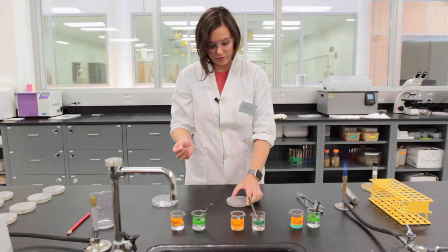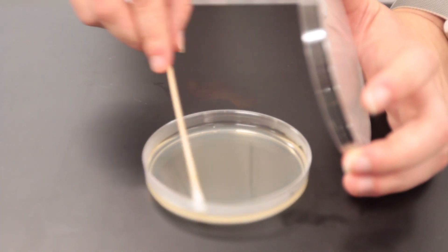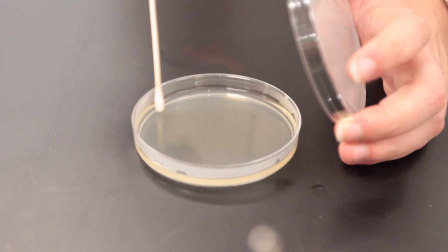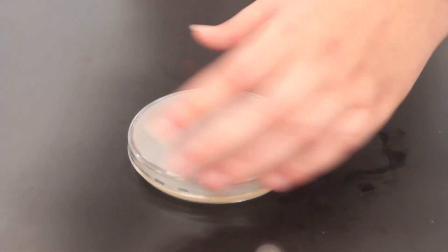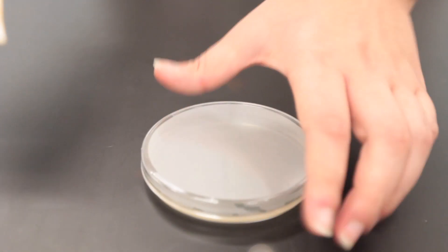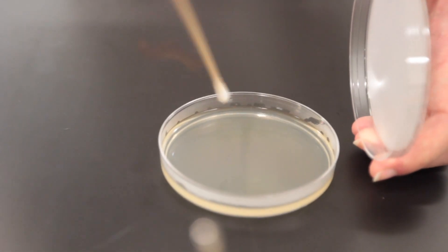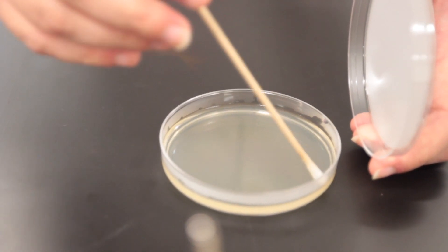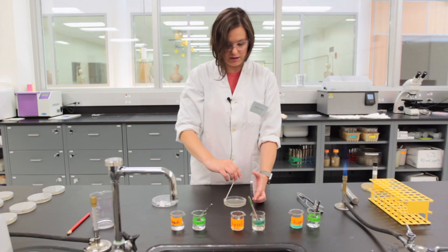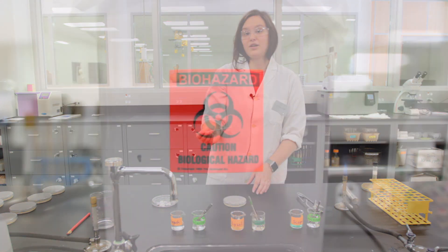You will be making a confluent lawn of bacteria on your plate. Streak the plate completely, going side to side all the way down across the plate. Rotate the plate and do the same thing all the way down three to four times. Once you've streaked all the way down, take your swab and do a final ring around the plate. Once you're done with your swab, discard it in the benchtop biohazard bucket.